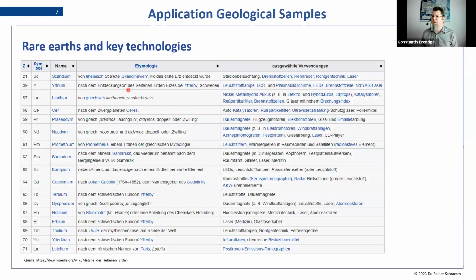Speaking of the change of analytes, I mentioned before that recently the applications that we at FLUXANA are using have been improved or built upon with a lot of new and interesting analytes, and rare earths have become very interesting for the industry recently. And analytically, they fall under the same category. We use them in this method for geological samples. And just to give you an idea where they find an application, we have a few examples here.